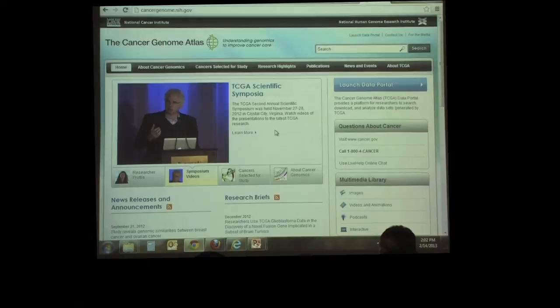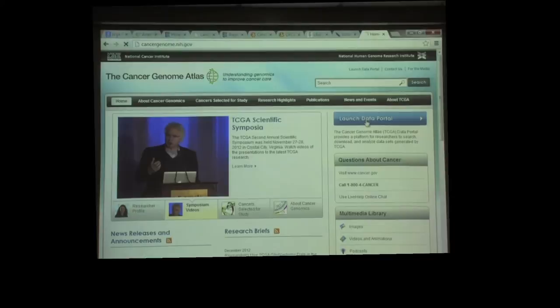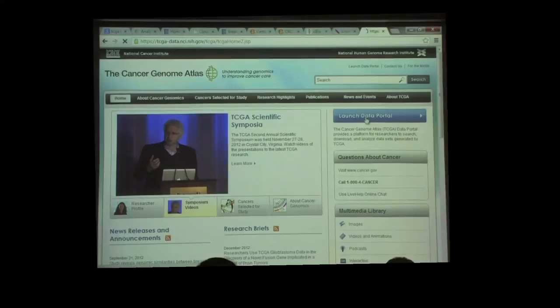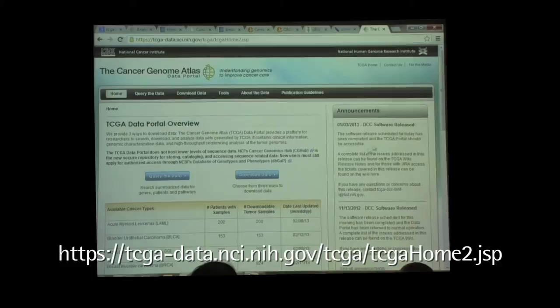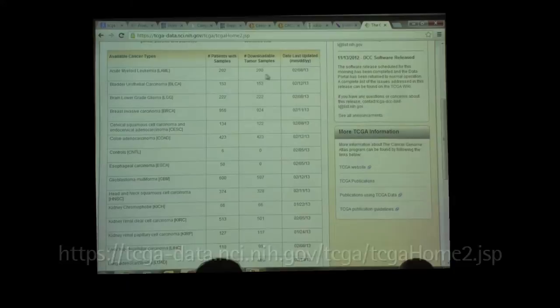You've probably seen this before. This is the TCGA main web page, and if you click on Launch Data Portal, that's where you see all the huge amounts of data that's already there. If you go to download data, these are all the samples that are there — available cancer types, number of patients with samples, downloadable tumor samples, and so on.